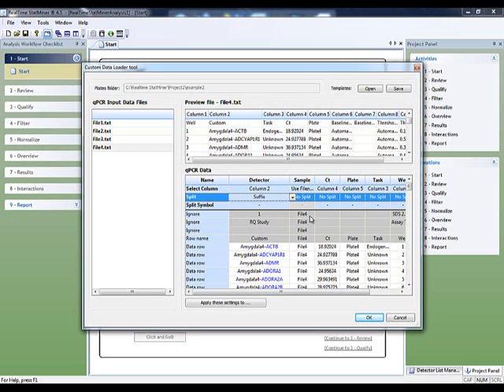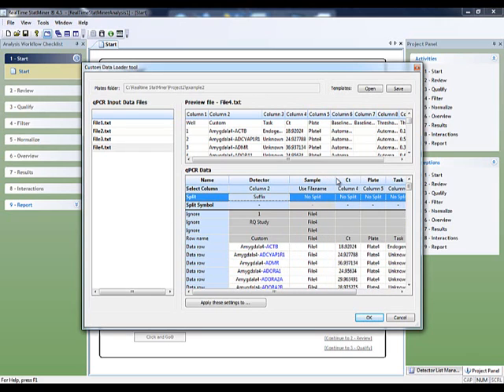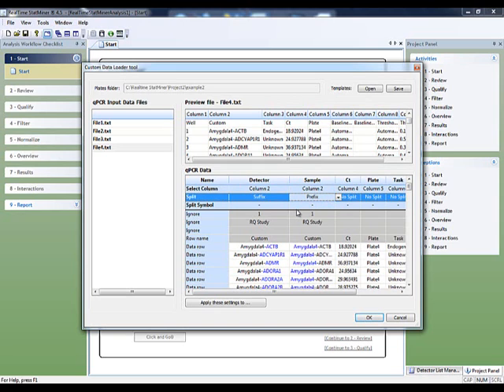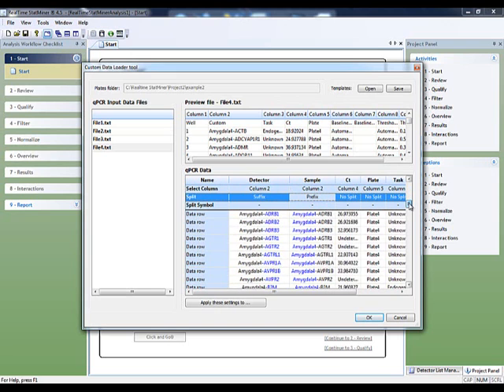Now it is the turn of the sample identifiers. It is not really mandatory that sample IDs are provided in the same column and can surely be stored in other columns. This split functionality can also be useful in case we want to remove some codes or other useless information pasted into any category.